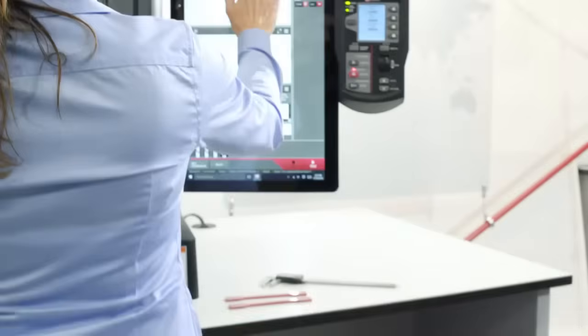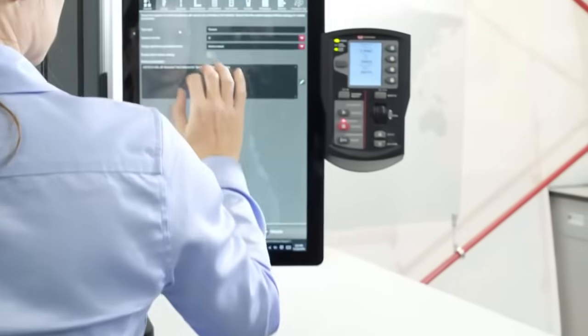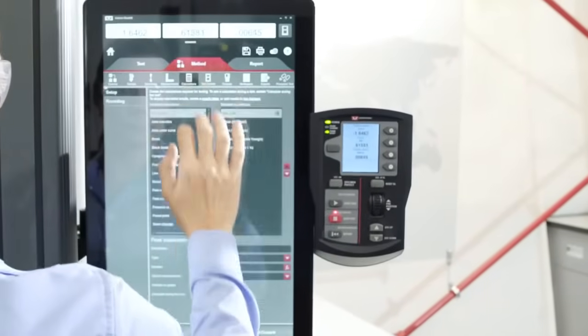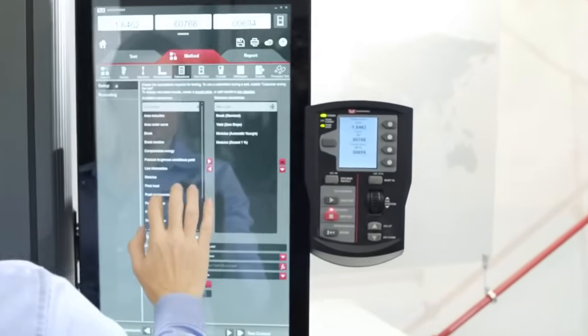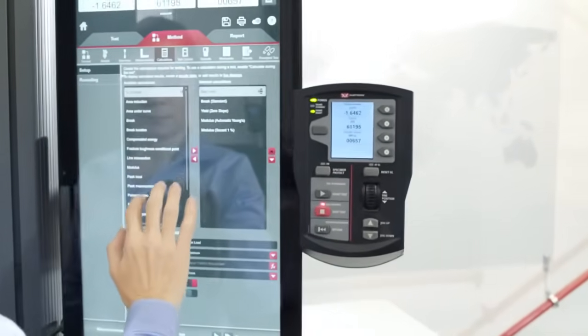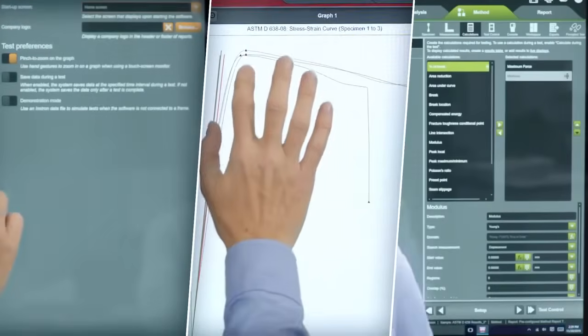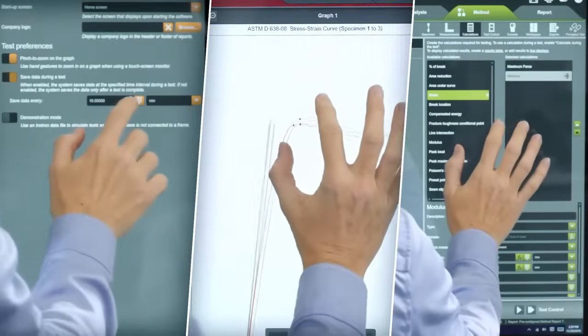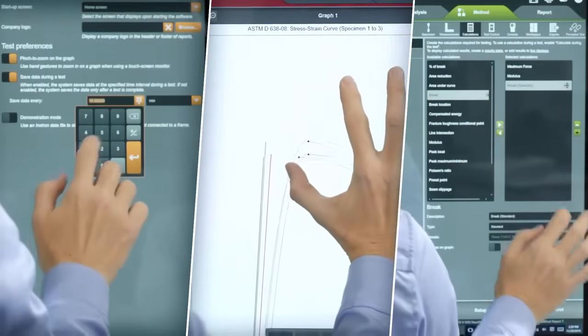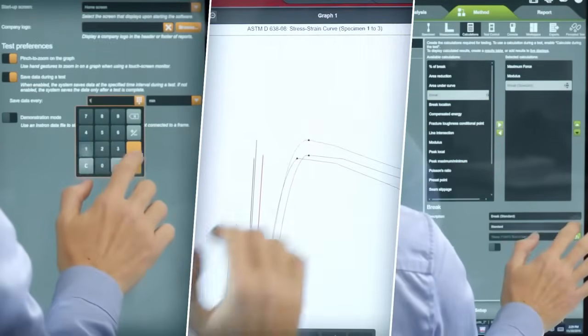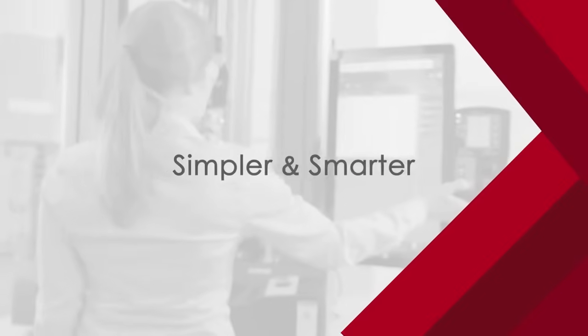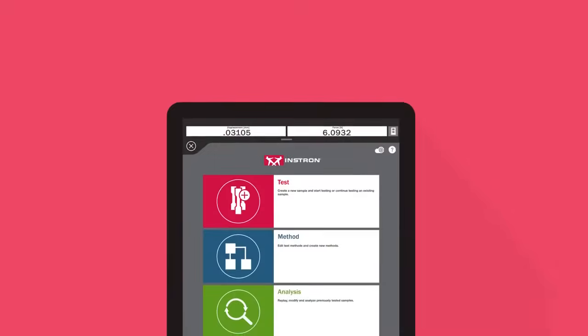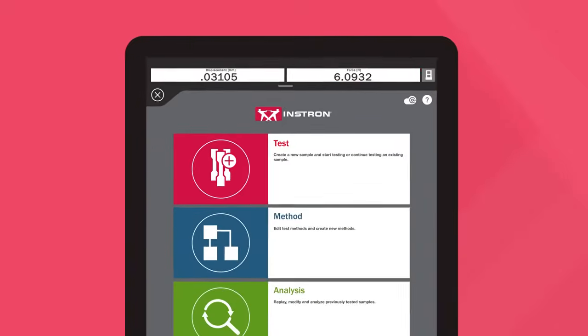Whether you're an experienced Instron user or whether you want to run quick tests from time to time, Bluehill Universal's large touch points, intuitive gestures, and easy-to-follow workflows make your testing experience simpler and smarter. Starting a test is easy.